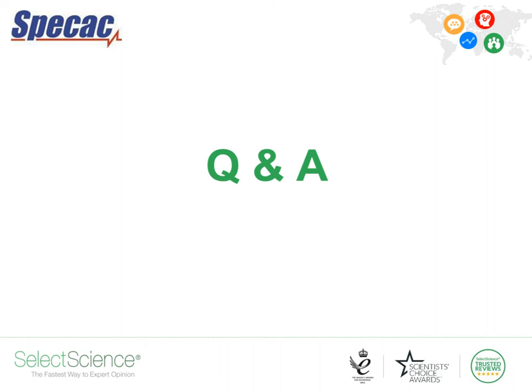Are there maximum load ratings on the pellet dies themselves? Yes, there are. So it depends on the size of die. If you have a 5mm die for FTIR analysis, for example, then you can only load that up to 2 tons, whereas all of our XRF dies are rated all the way up to 40 tons to be compatible with our top range of presses.